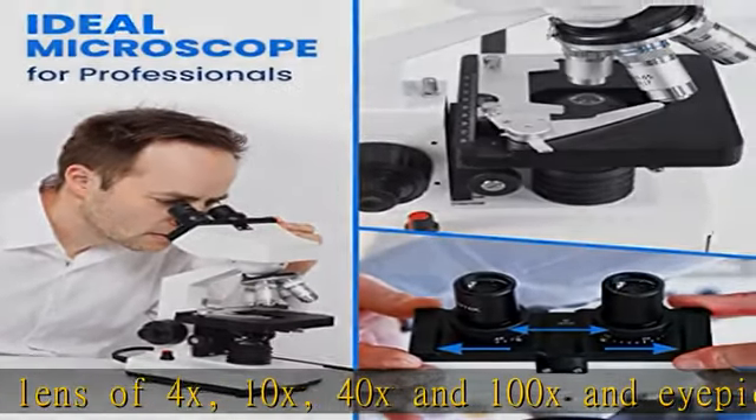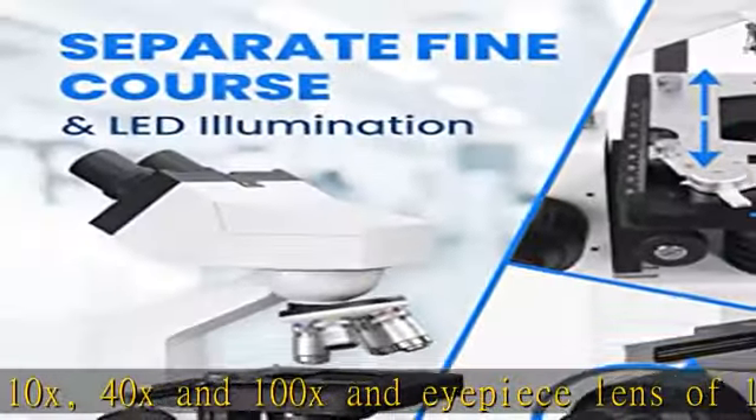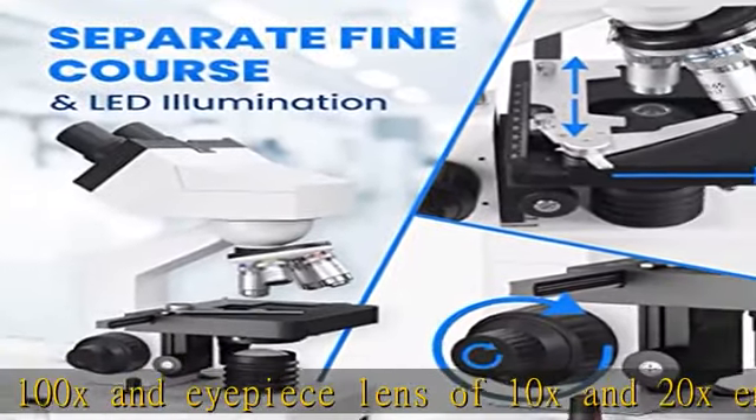Suitable usage for science labs, professional, homeschooling, or microscope hobby. It is well built.